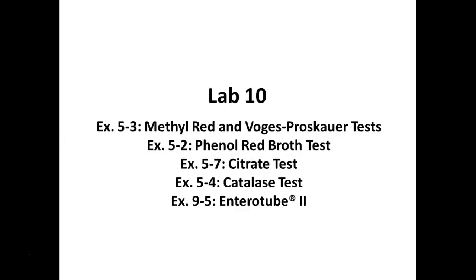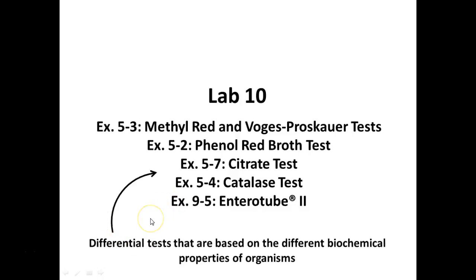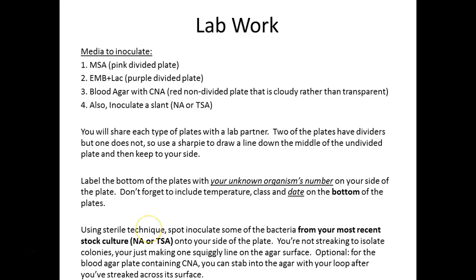Glucose is a common sugar. In the past, we used to do the Methyl Red and Voges-Proskauer tests tonight, and the Phenol Red, and look at citrate, catalase, and talk about nitrate. Especially with doing the inoculations, which we've already actually done this semester, that was a monster lab, right? So we're saving these two for next time, and this is actually going to be included in one of the later ones. But these are what we call differential tests, right? Differentiate the biochemistry of your organisms.